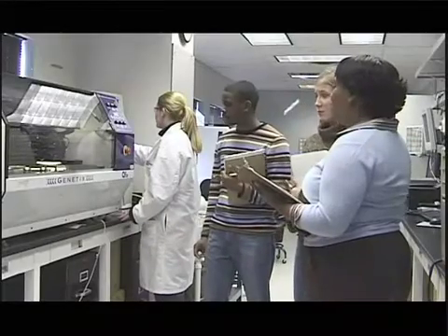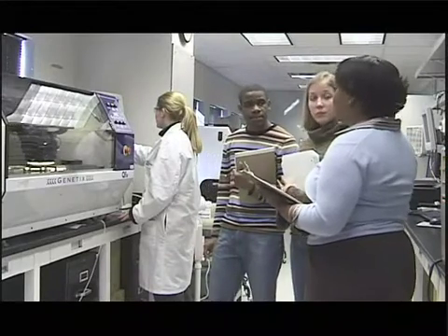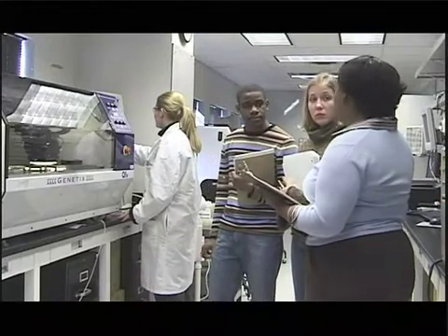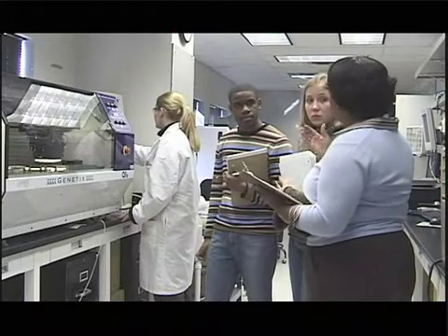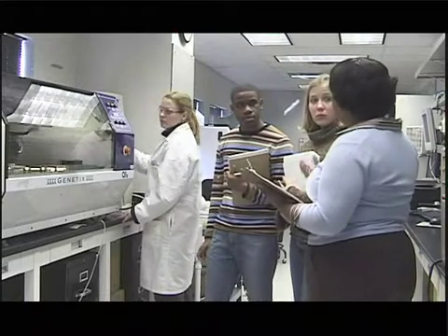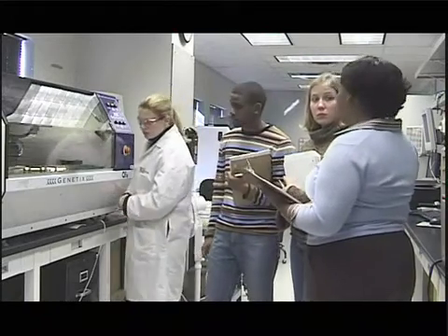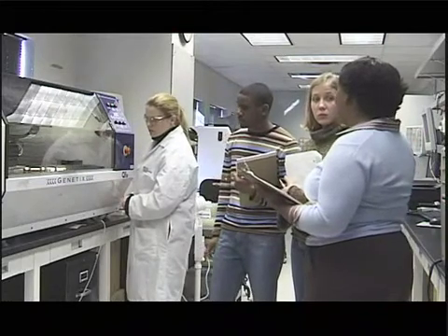What happens if it doesn't grow? Well, we don't worry if a few wells per plate don't grow. If a significant number did not grow, we'll discard that plate, and then we'll go back to the agar plate and pick new colonies. This is an important quality control and cost saving step.